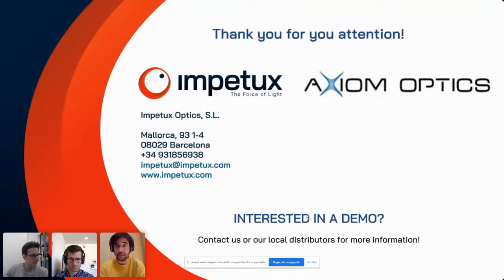We can use silica particles to increase the contrast and then increase the force, or we can increase the force even more by using, for example, polystyrene particles and use them as handles, like in the experiment that Oriol was showing. There the customers were putting these microspheres inside the cell so as to increase the contrast with the surroundings and then increase the optical force. With these polystyrene particles, one can easily reach 100 piconewtons, which is a force that allows you to tackle already many different questions.